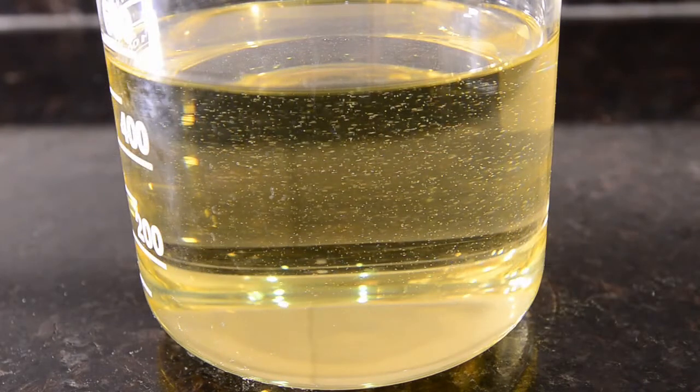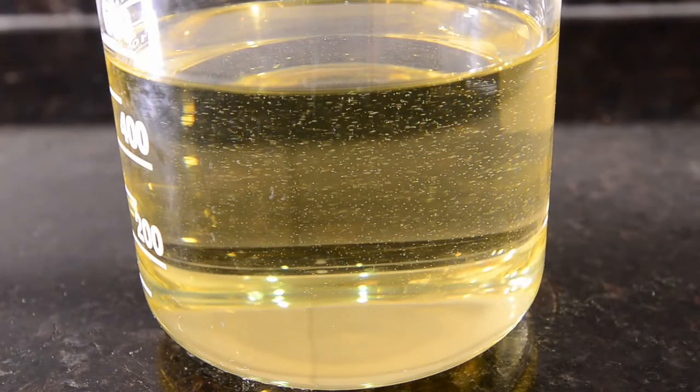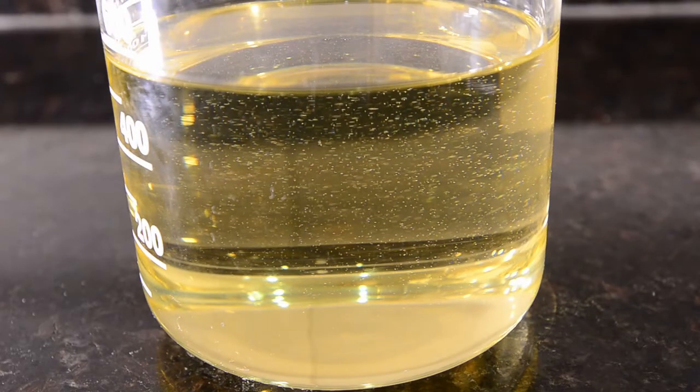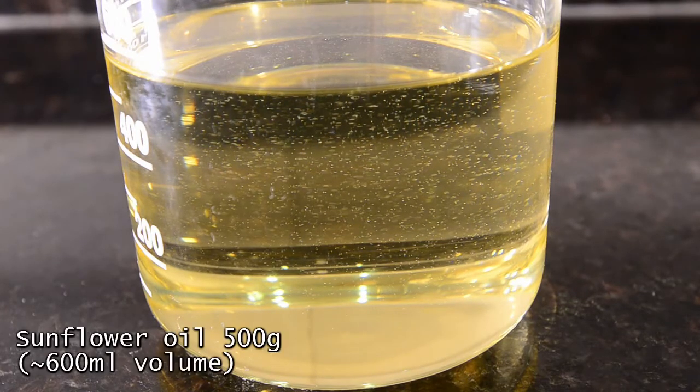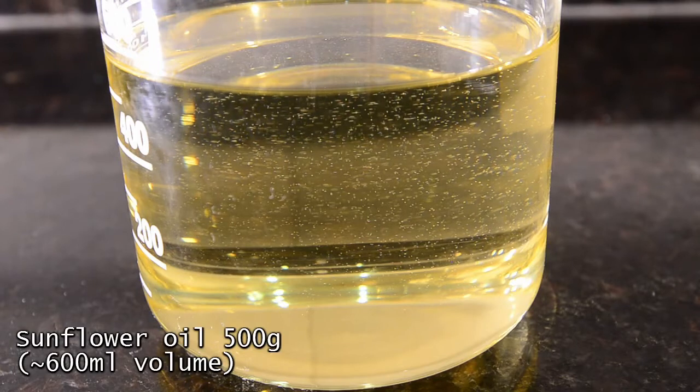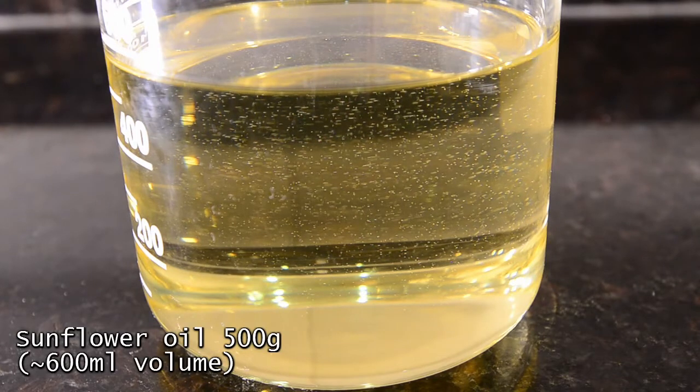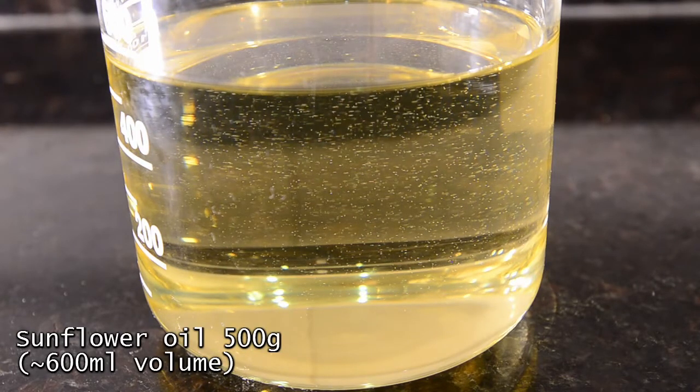Palm oil is the best, but rapeseed, canola and sunflower oil also work well. We're starting with 500 grams of sunflower oil which is around 600 ml in volume. We've poured this into a large 1 liter beaker.